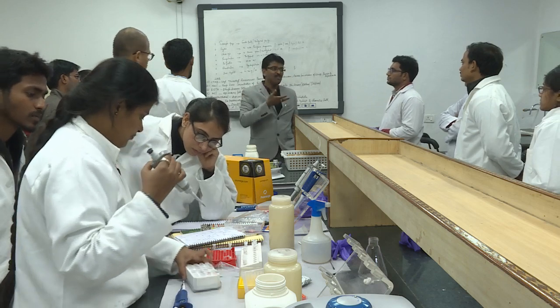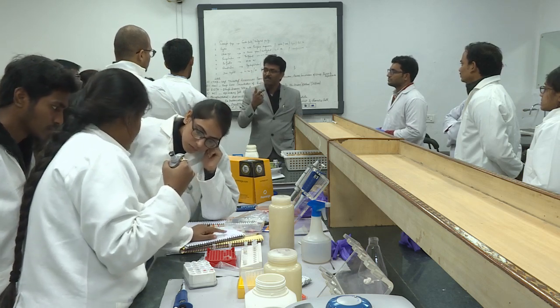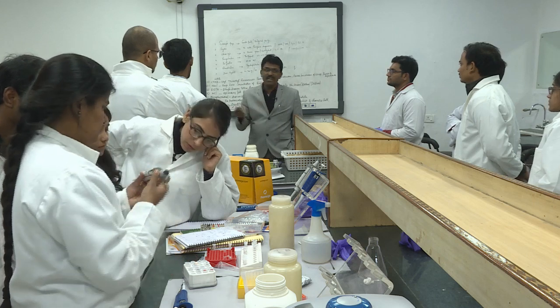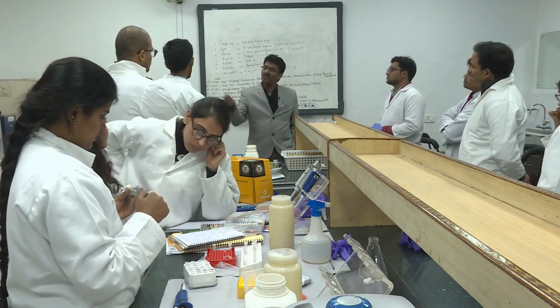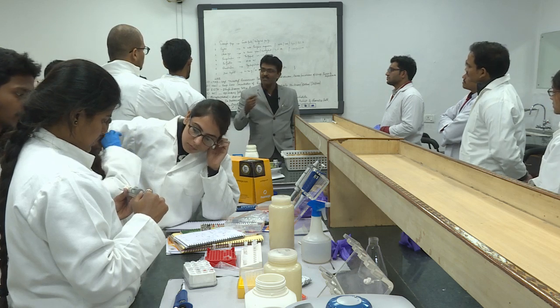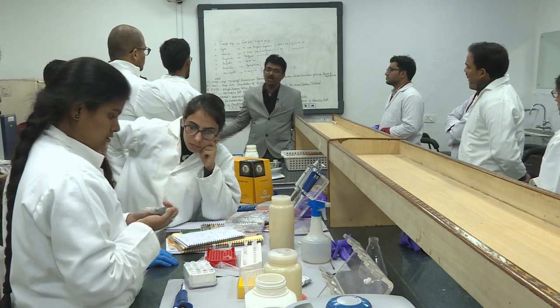Then that mycelium is taken and put in the Eppendorf. Then you put glass powder and grind it with the machine, or optionally you can go for liquid nitrogen. You add liquid nitrogen, then it becomes so brittle and becomes powder, right. So, then you add the lysis buffer, then you incubate it, then you make a homogeneous lysate, then clean up step, and you go downstream.